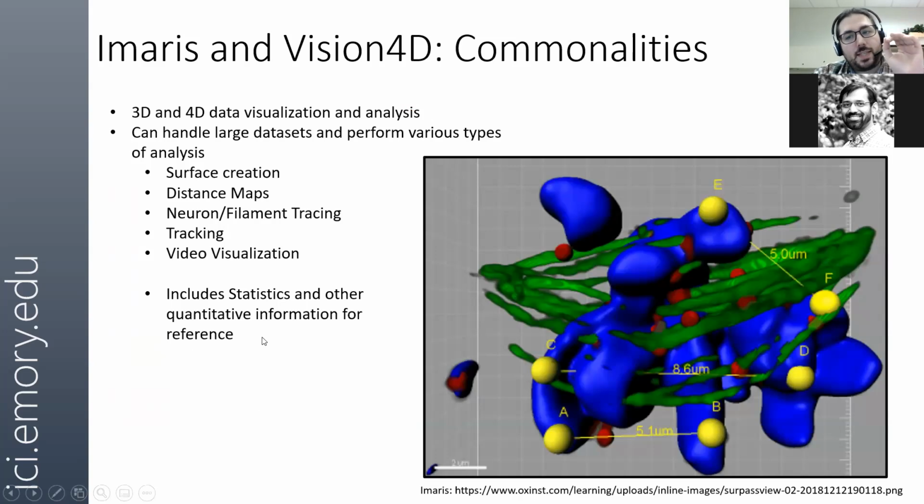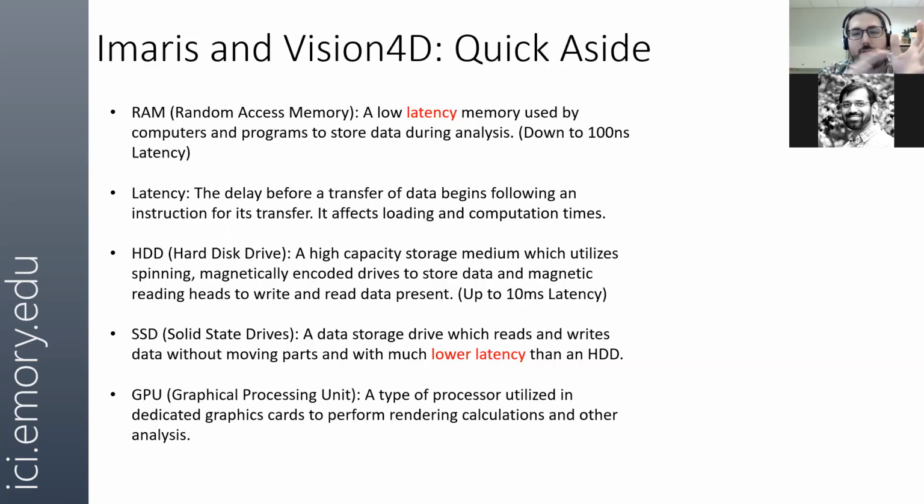Now, all of these calculations I'm talking about, all of the statistics that you would get from both of these softwares, does beg the question of how taxing they are to run for a computer. So we'll take just a very quick aside. I won't go over all of these terms in detail, but we want to remember latency, which is how long it takes a piece of data to know that it's being moved somewhere else or being analyzed.